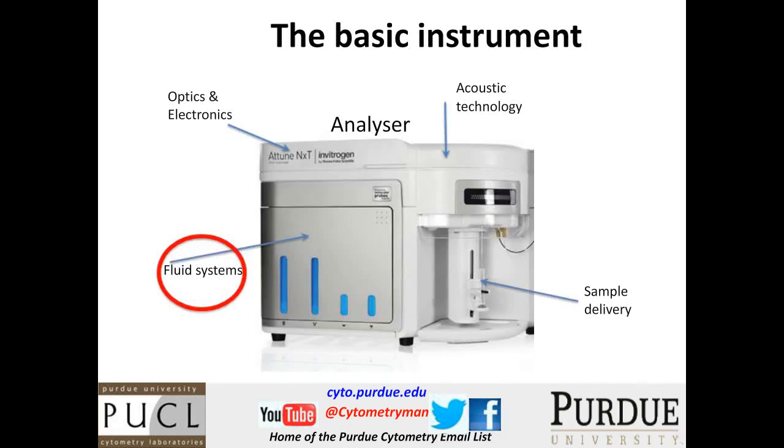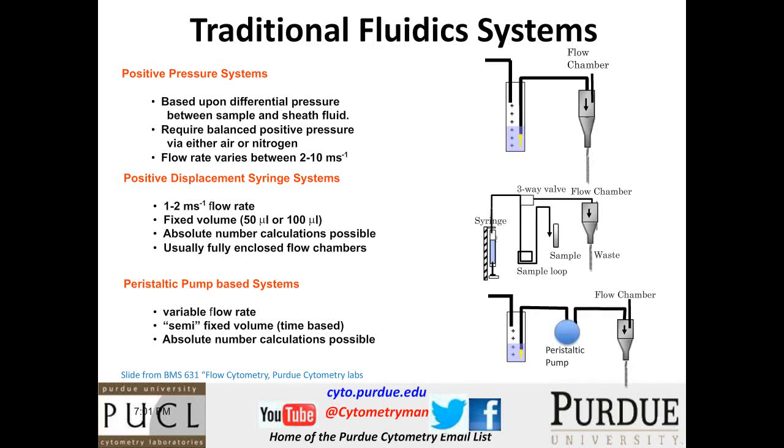Well, there's a couple of other things that I think are definitely worth discussing on the Attune, and one of them is the fluidic system. Going back here to another slide that I have had for many, many years. The only modification I've made in this slide in 20 years is I added the peristaltic section here, because that's been something that I've noted in the last several years in terms of delivery of samples.